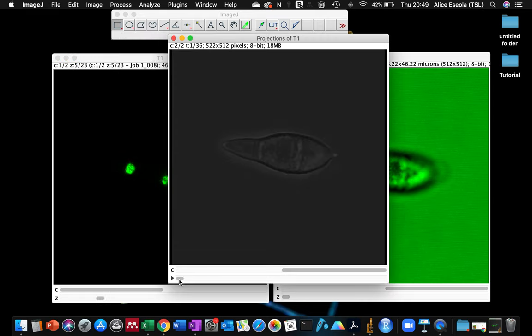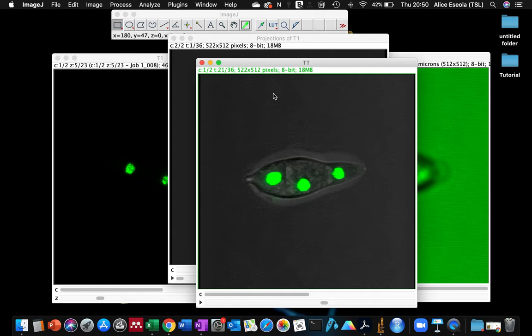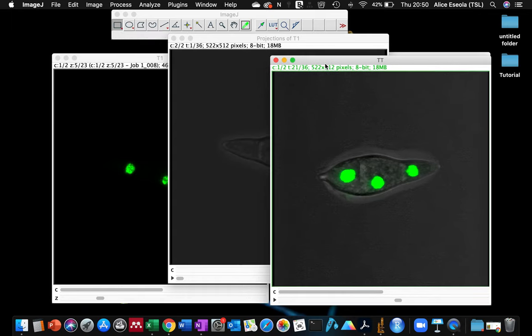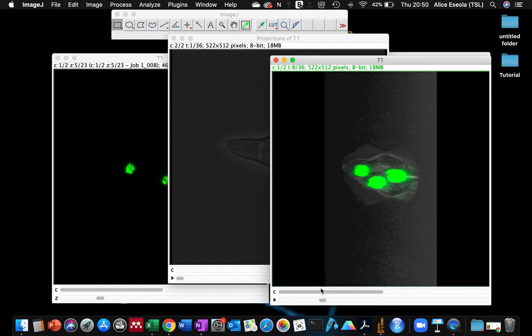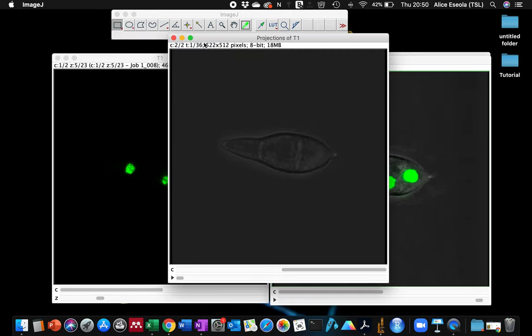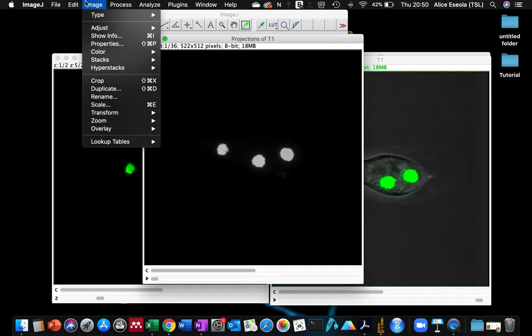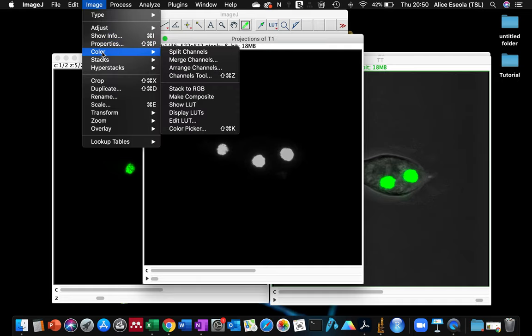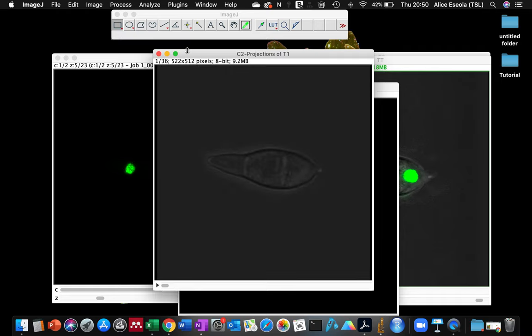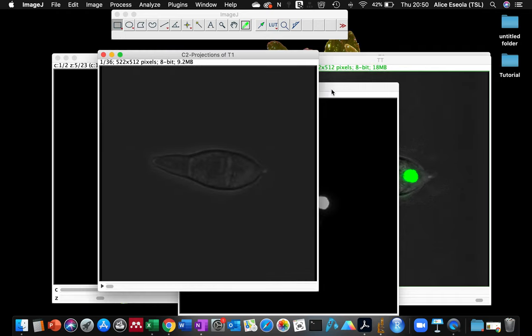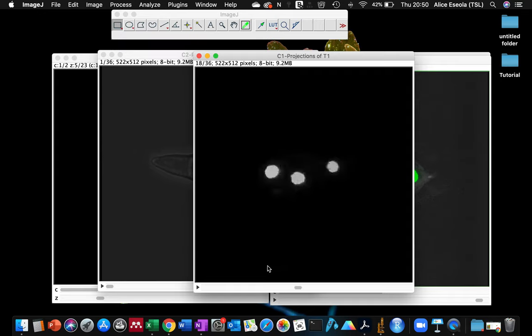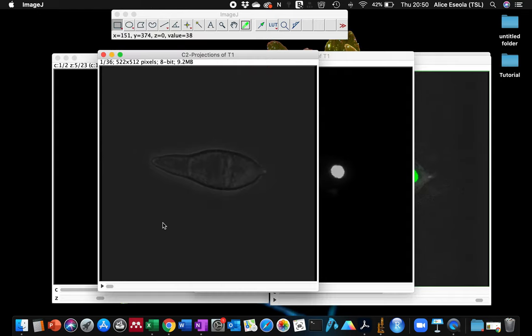The next thing for us to do in order to have this type of sample where your fluorescent sample is shown inside the brightfield, you go to the 3D projection sample and split the channels. Now you have the two channels independent of each other.